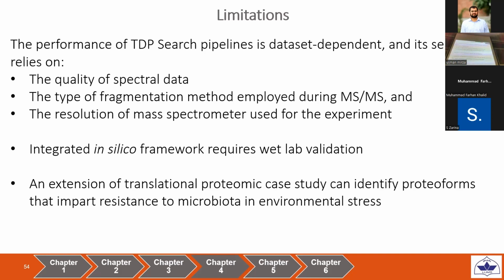Thank you. So why do we use FDR? To validate that the data that we have identified is correct. And how would that happen? So FDR calculation, in a generalized statement, calculates the false positives.